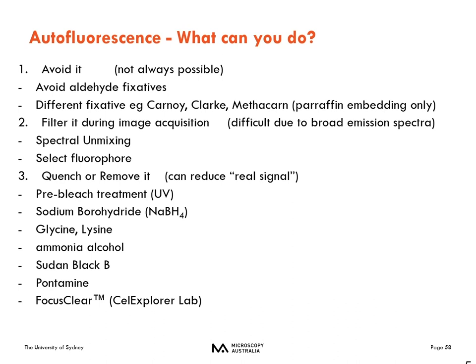So secondly, we try to filter it during image acquisition. But it's also difficult because autofluorescence has a broad range of emission spectra. We can use spectral unmixing with a spectral detector on the confocal microscope, or we select fluorophores which are well separated apart.